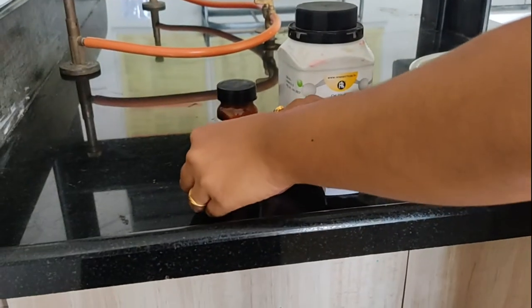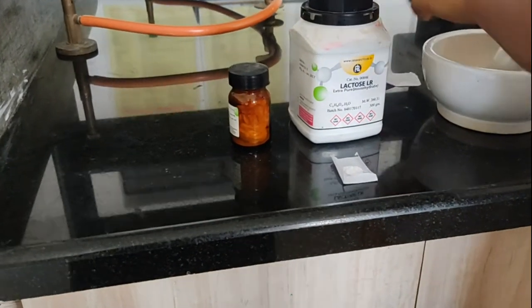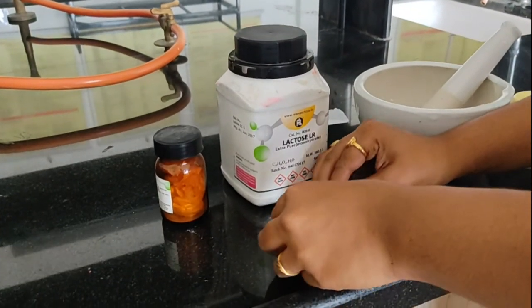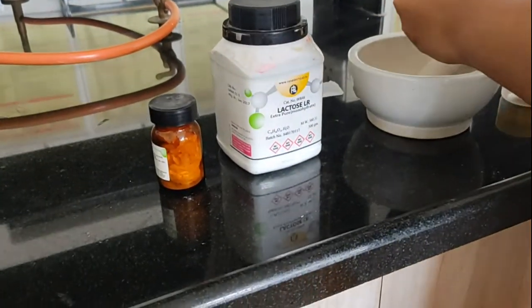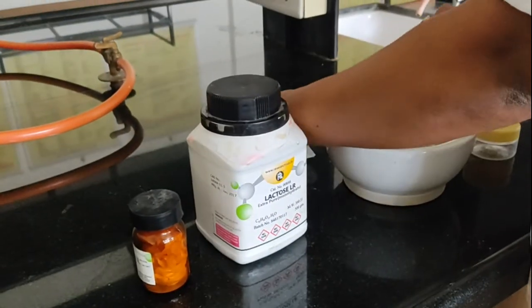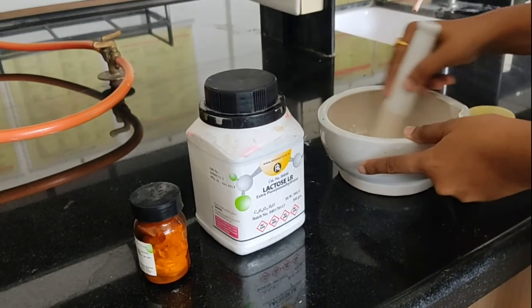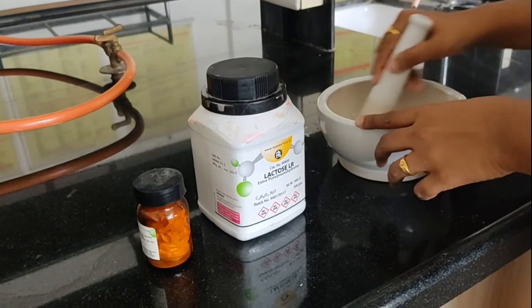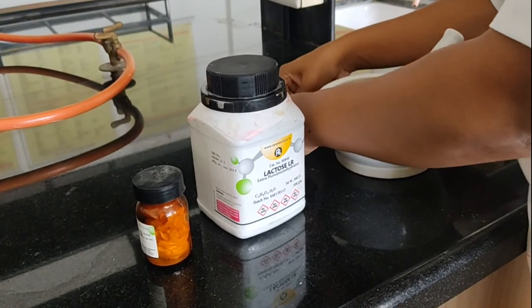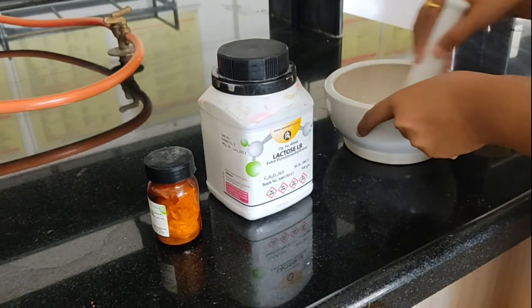First of all, I am going to take this hyoscine hydrobromide into this mortar for trituration. After that, I am going to add the lactose into it. First I will add only half the amount of lactose and proceed with proper trituration. After proper mixing of both the powders, I will add the remaining amount of lactose and again proceed with proper mixing.